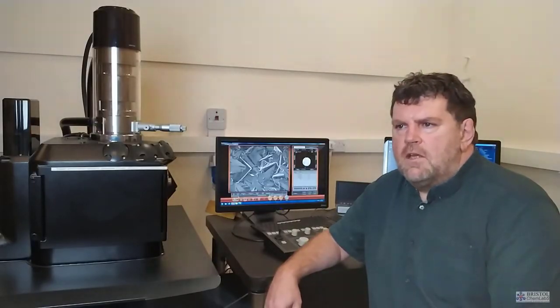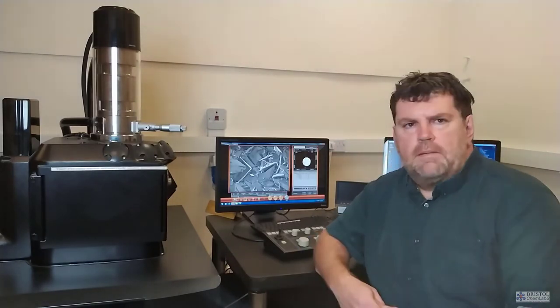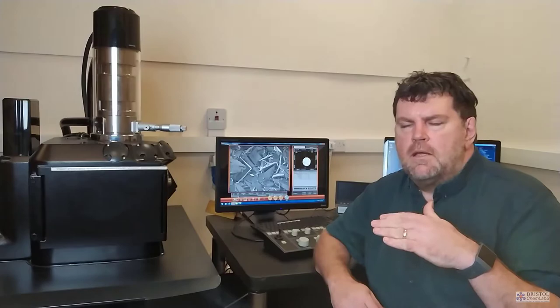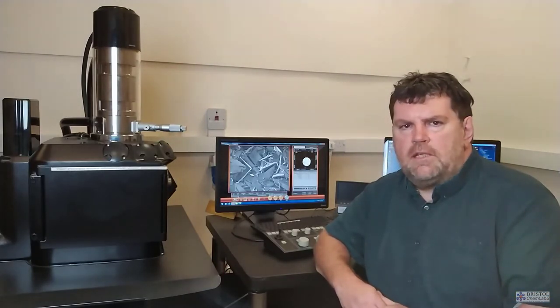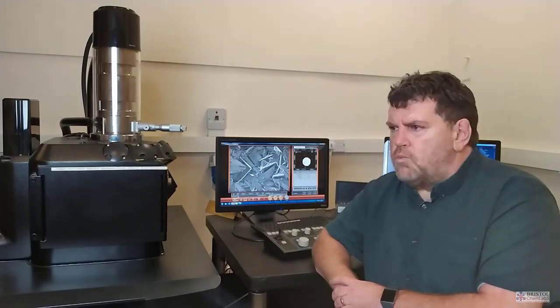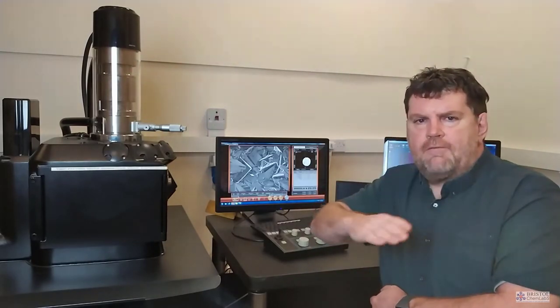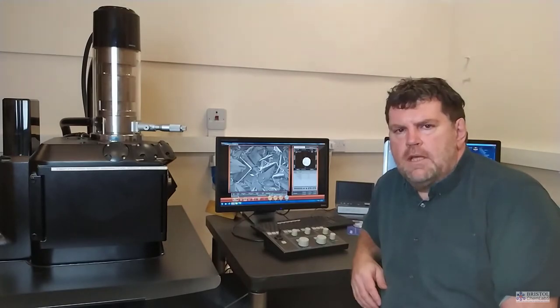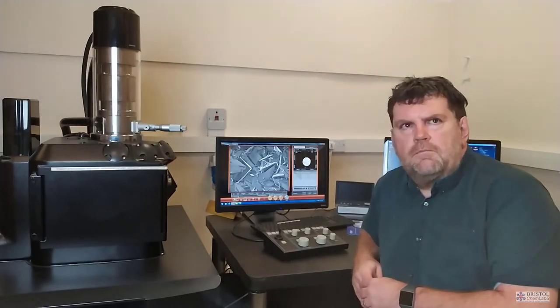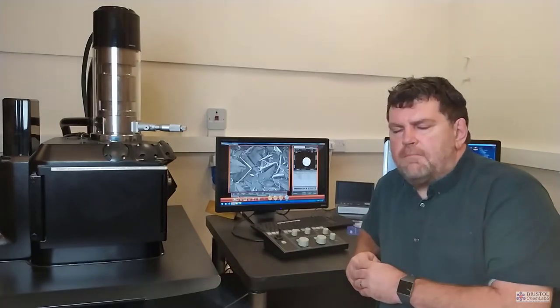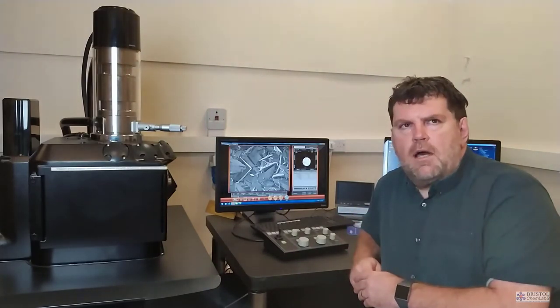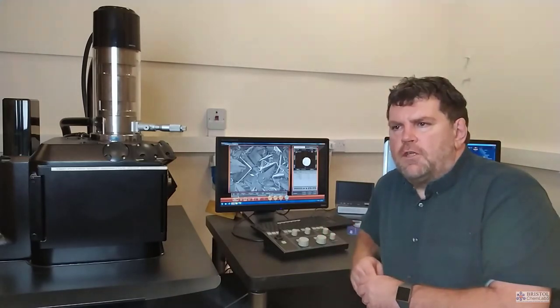Any images you see that have been colored have been false colored because the nature of how the image is produced purely produces a grayscale. It's binary. All you see is a relative intensity from extremes of black to white. In this case with the secondary electron image, which is most of the imaging I've shown, what we're focusing on is seeing topographic differences in height. There is another imaging mode called backscattered electron mode that has various versions, but predominantly it shows contrast based on relative atomic weight. Something like gold would appear brighter than carbon, assuming there was the same volume within the material.